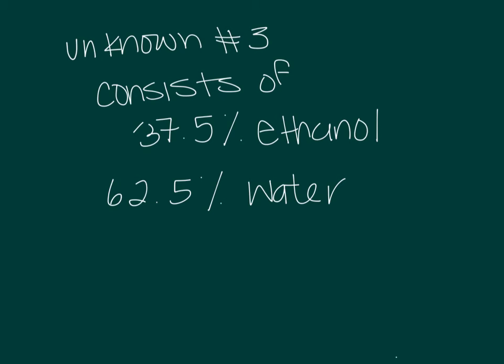As I mentioned before, this was determined by the percent composition calculation, which was used by the change in temperature from fractional distillation, because in simple distillation, it was less of a drastic change in temperature, so it was a little bit harder to see where the ethanol ended and water began.